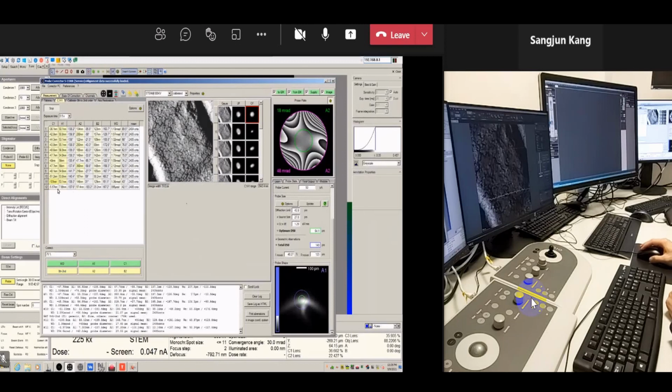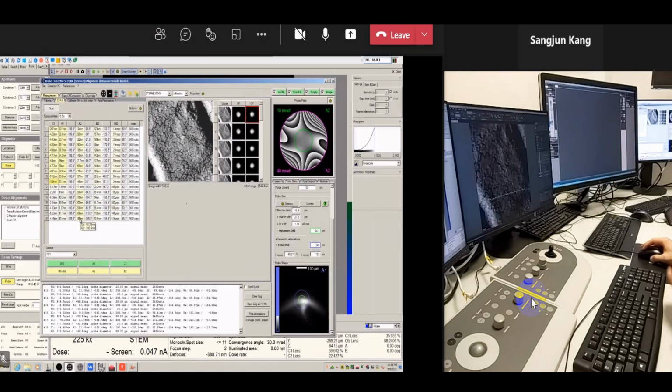So we just take a look at the numbers there. If you see the color, the deepness of the color is telling you what the current problem is. If it's more yellow, it's more problematic, and if it is more white, then there is no problem at all. So now you see here A2 has a problem. So we are changing A2 by 75% of this value, which means we are not 100% trusting this calculation.